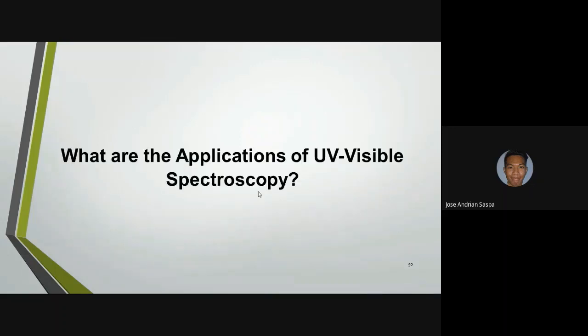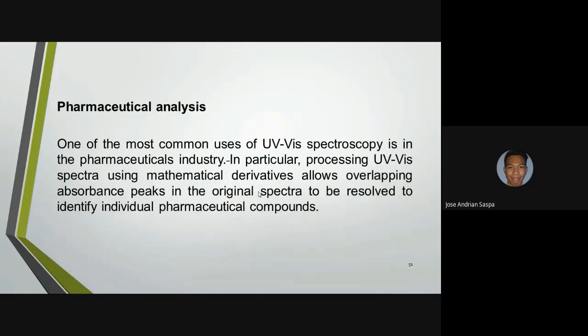What are the applications of UV visible spectroscopy? One of them is pharmaceutical analysis.